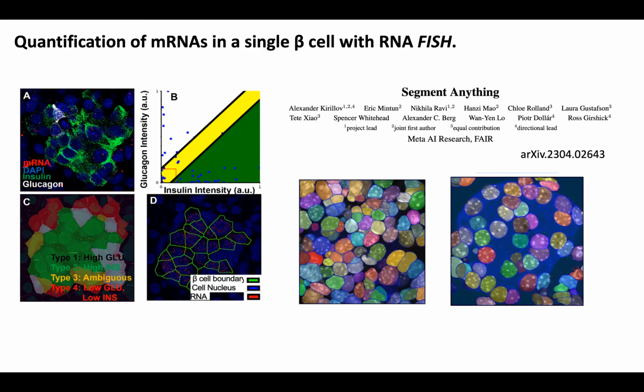So I highly recommend these tools for any wet bench scientist who wants to do segmentation, and it works very well even for bright field cellular images. Which means the M1 is almost completed. This is just a simple joke.